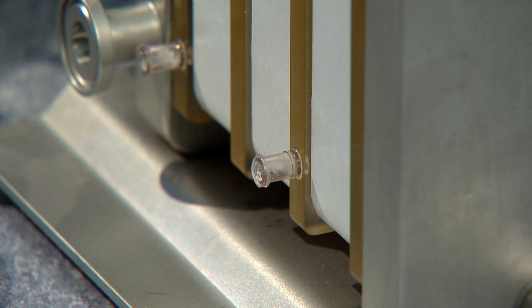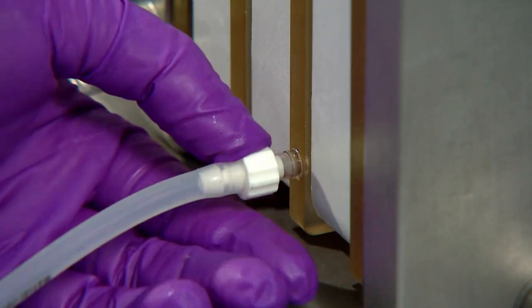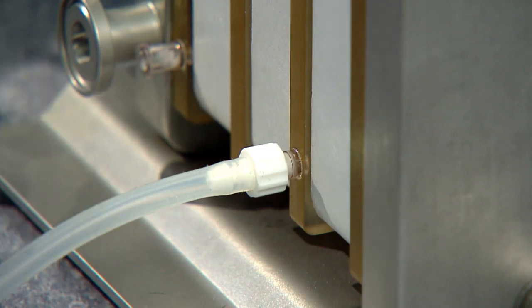The permeate lines are opposite of the retentate ports. Install permeate collection tubes on each port.